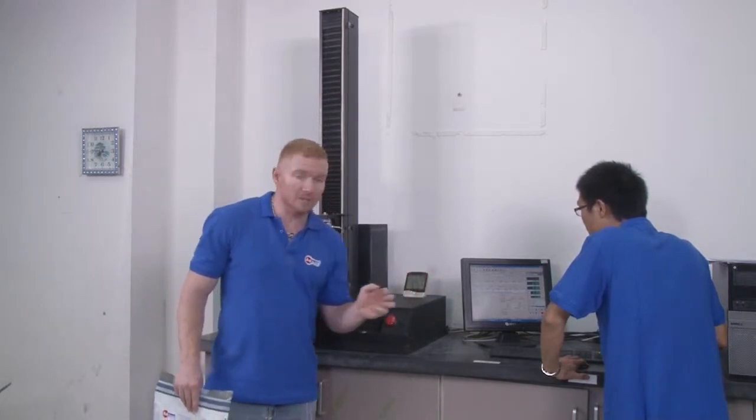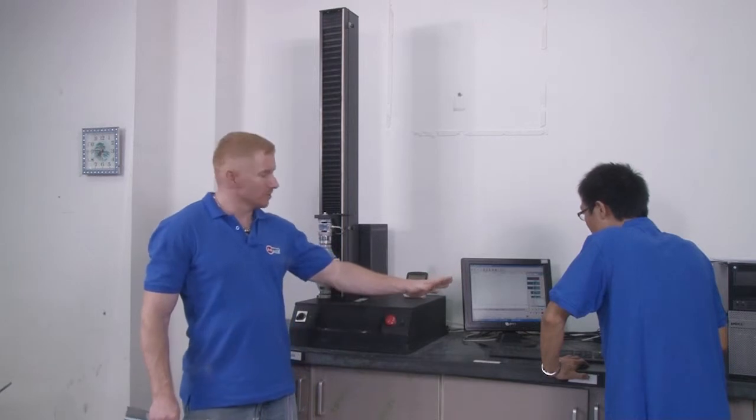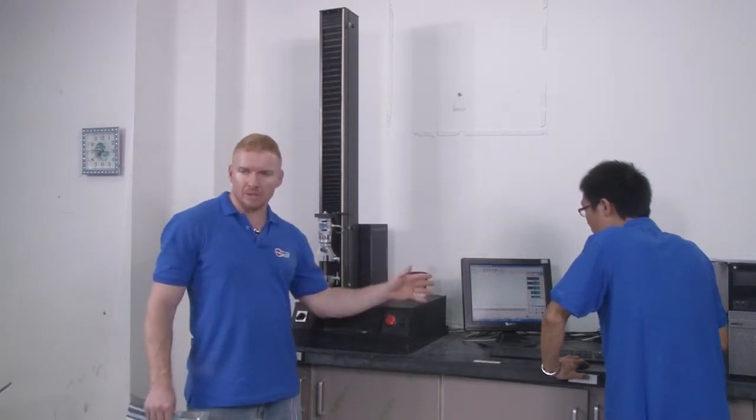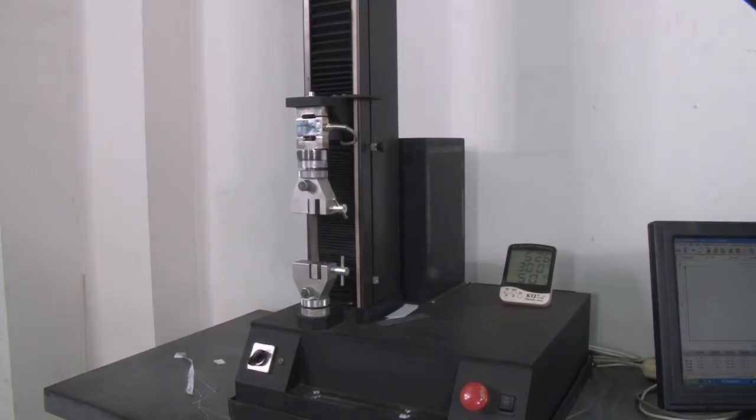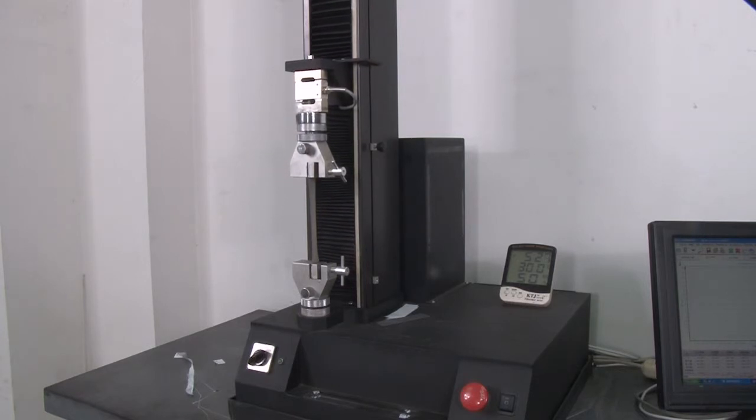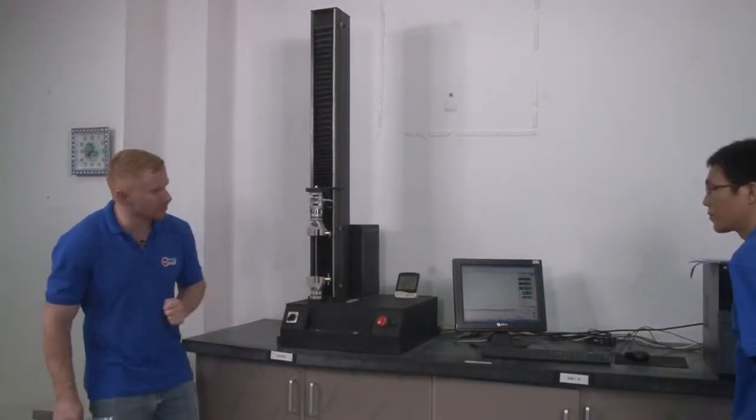We have the strength, the ASTM ISO standards for testing the film strength. When we start the test, this machine will go up, testing the film. It's very important to the design. We can tolerate a great amount of stress for the customer. All data is collected in the computer over there.